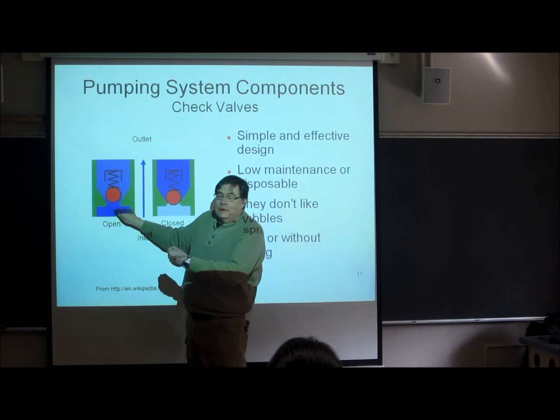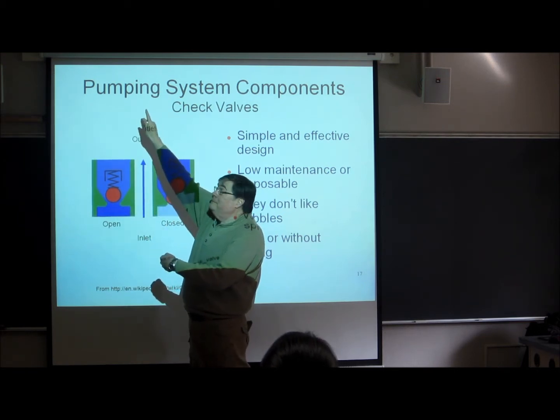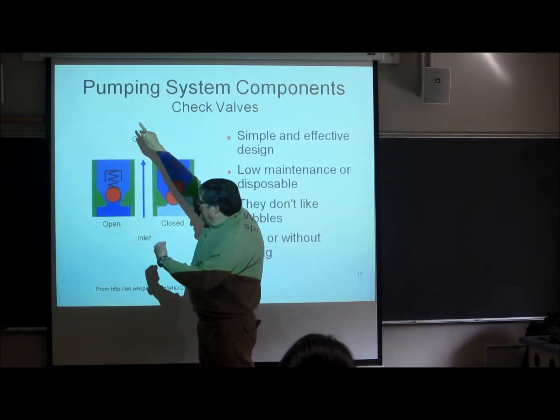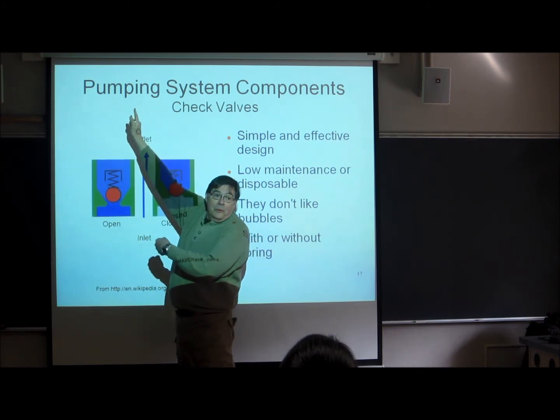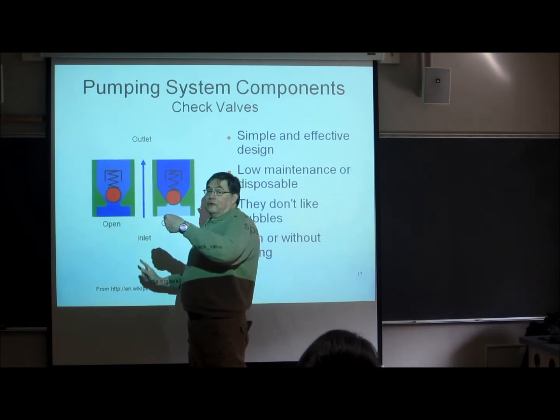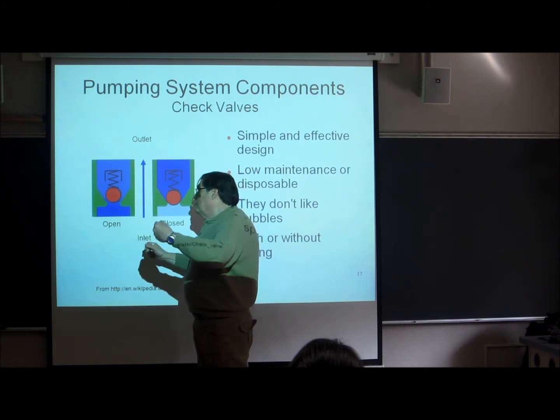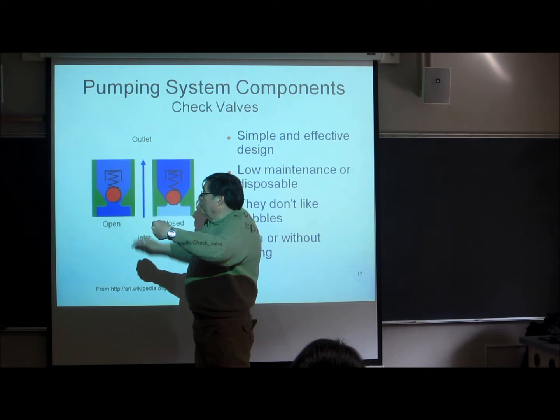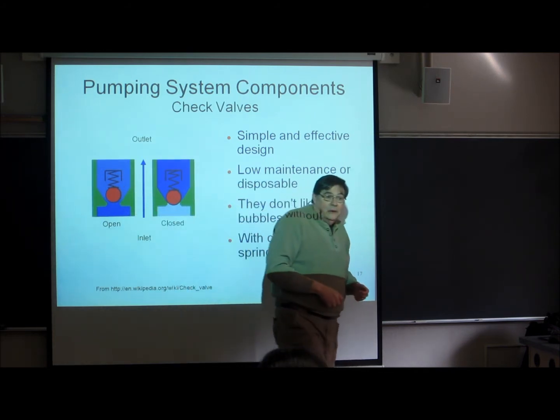Okay, not so difficult. Remember, there's another check valve up on the top, above it. And when we push on that to close this one up, that pushes the ball up on the one up above. So the balls work together to direct the flow through and over to the column. So when we push, it goes up. When we pull, that one closes, but this one opens up and it refills the piston chamber, okay?